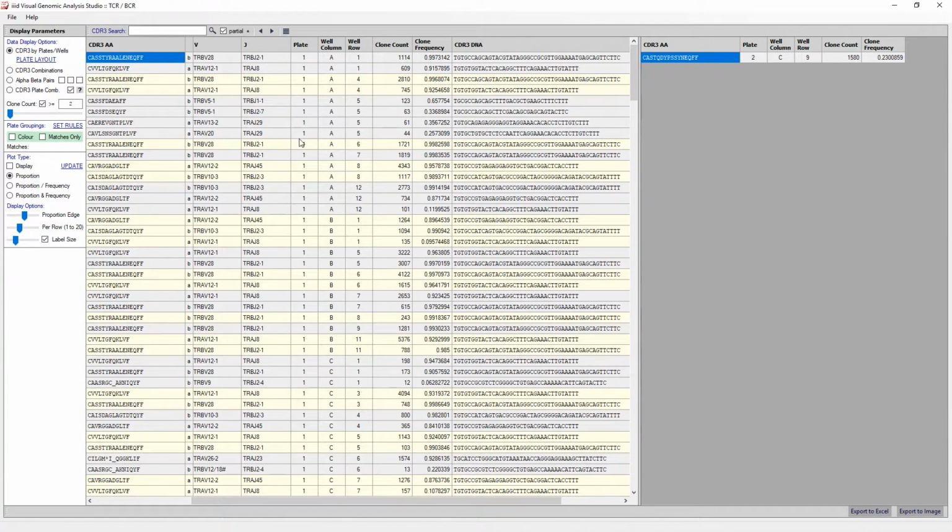All the data for each grid can be exported to an Excel spreadsheet. All the data displayed in all 4 primary grids are saved in a worksheet, plus also the data currently displayed in the secondary grid, if any.